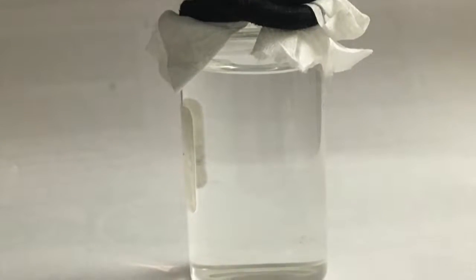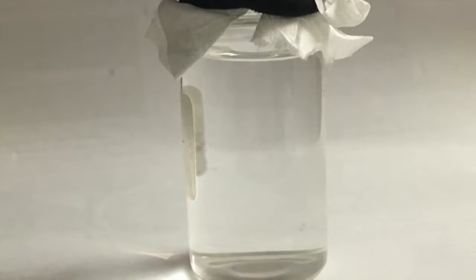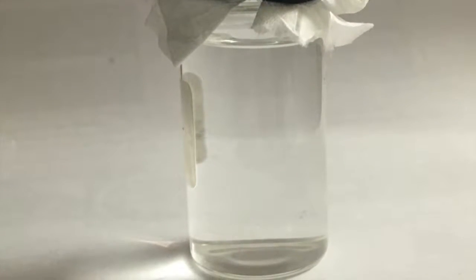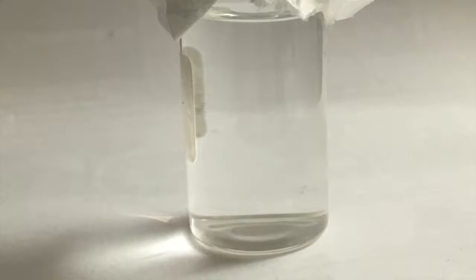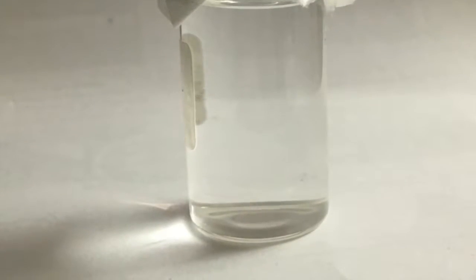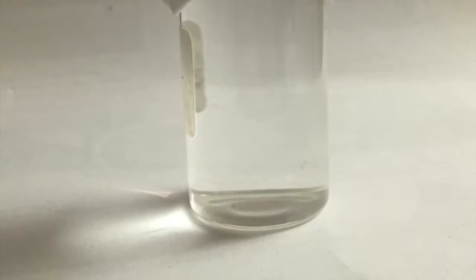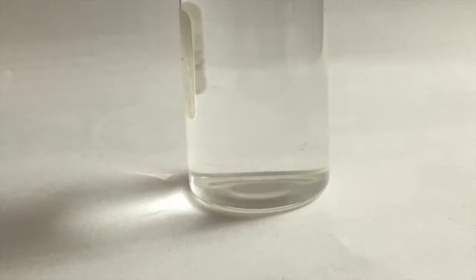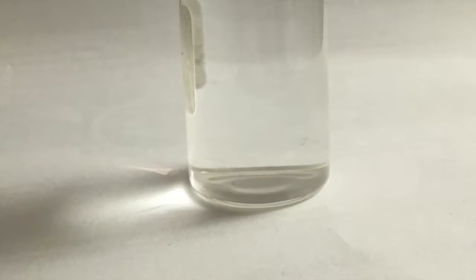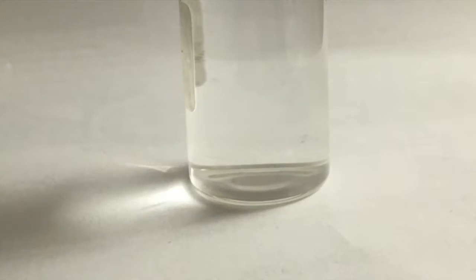At this point in time, there could be incredibly small crystals forming, or the ions may not have collided in the right way for the crystal to begin growing yet. One possibility that could explain this phenomenon is that an insignificant amount of water may have evaporated from the vial, preventing the concentration of alum from increasing past its saturation point and preventing solid alum from crystallizing in the vial.